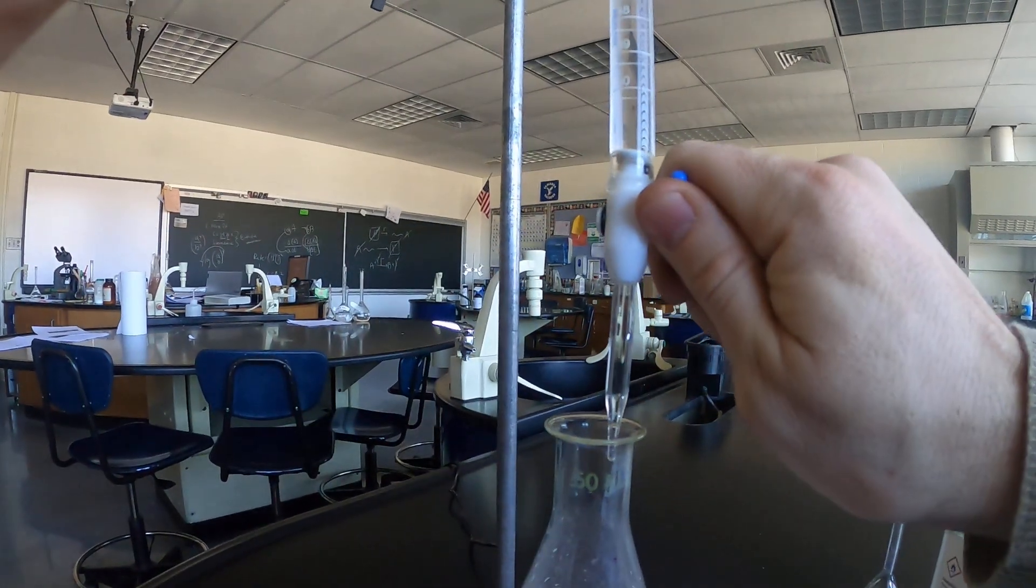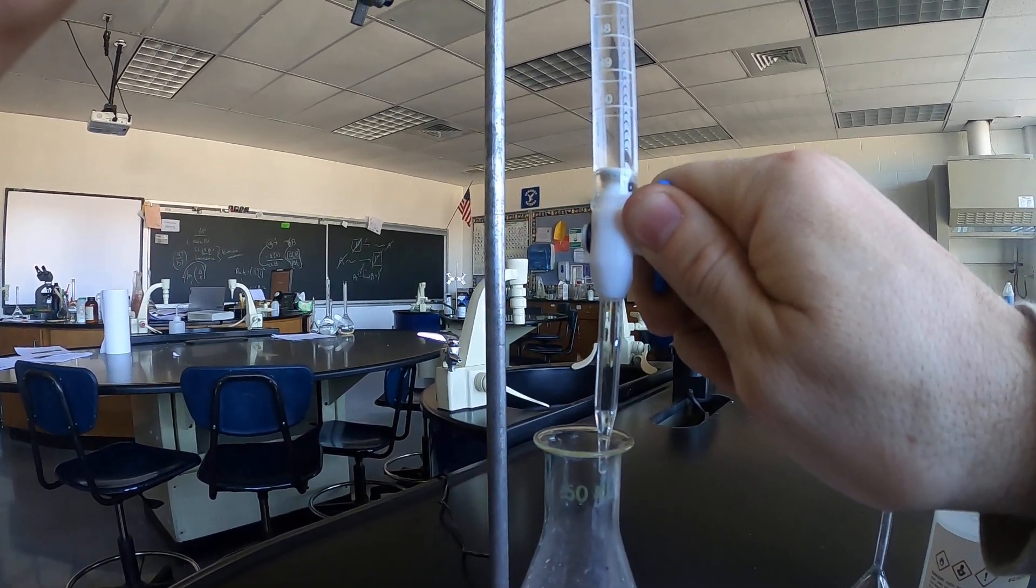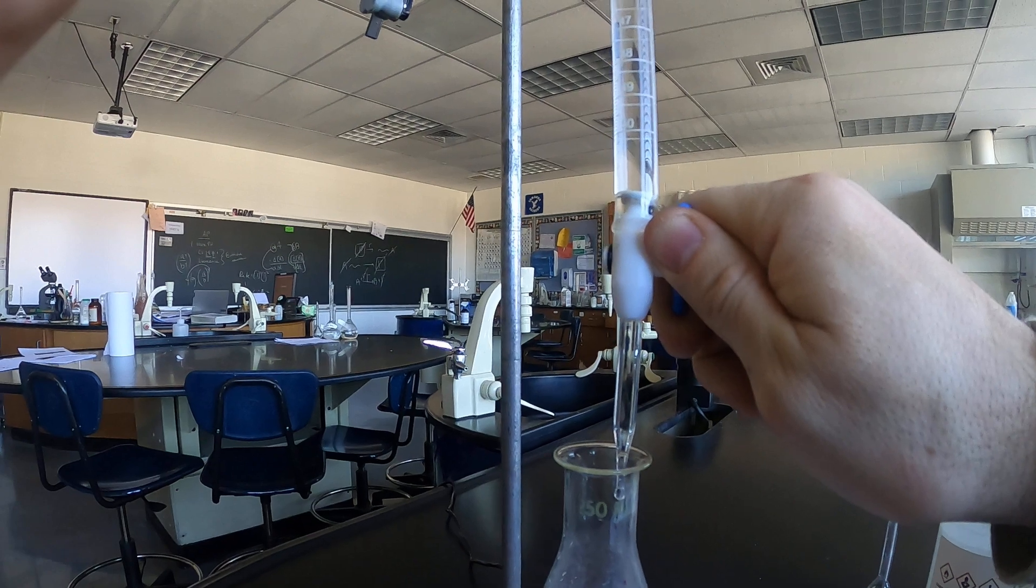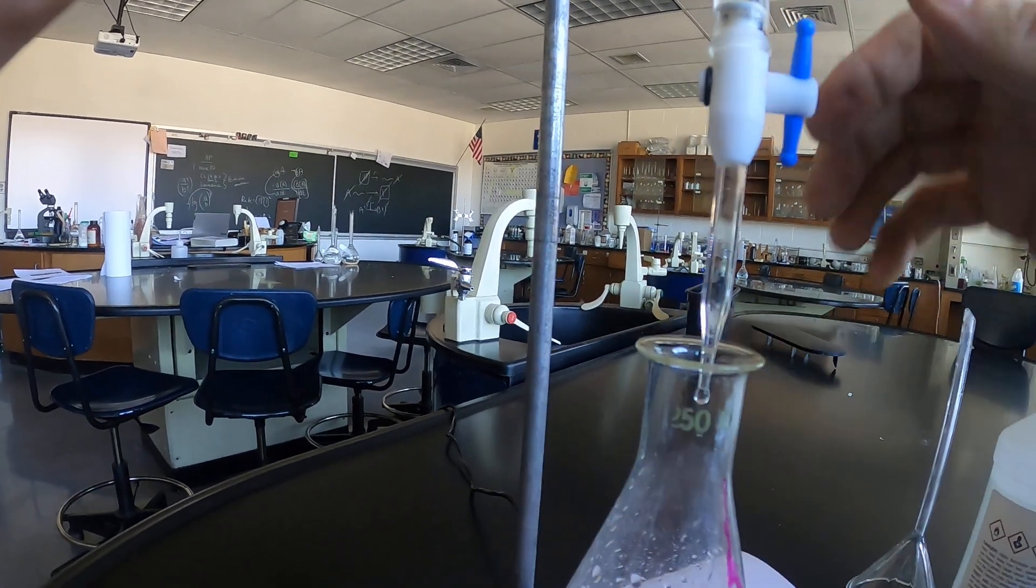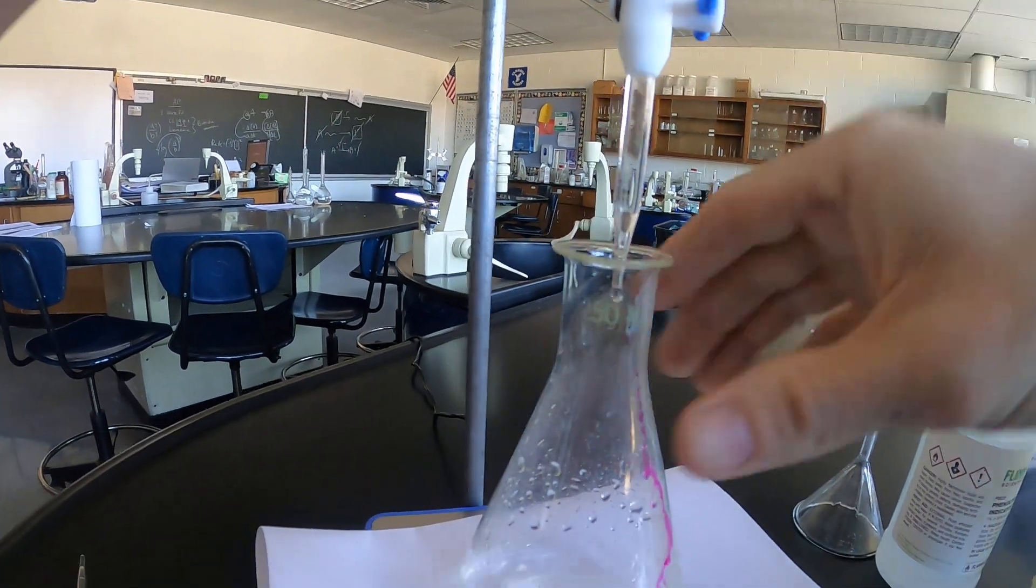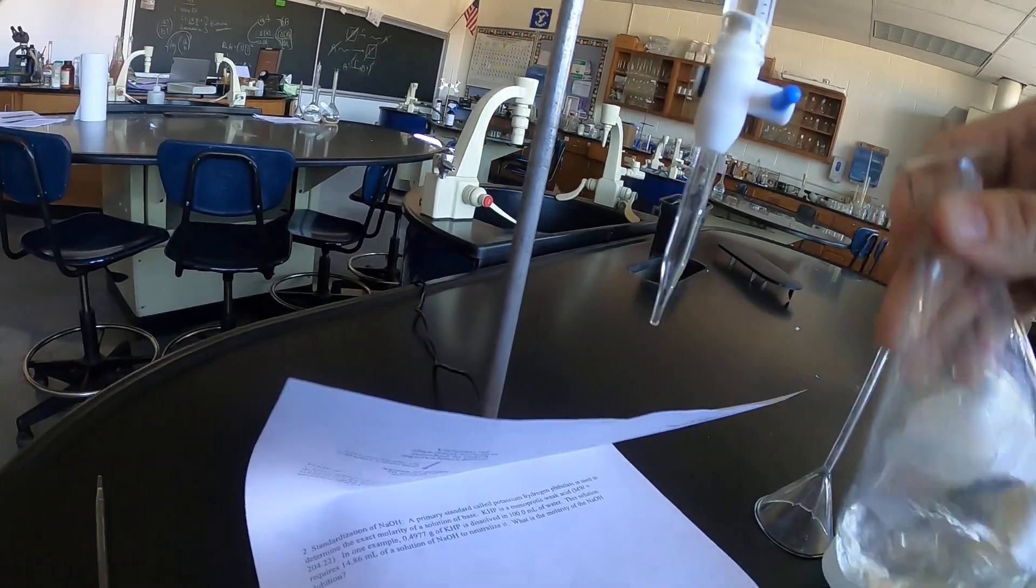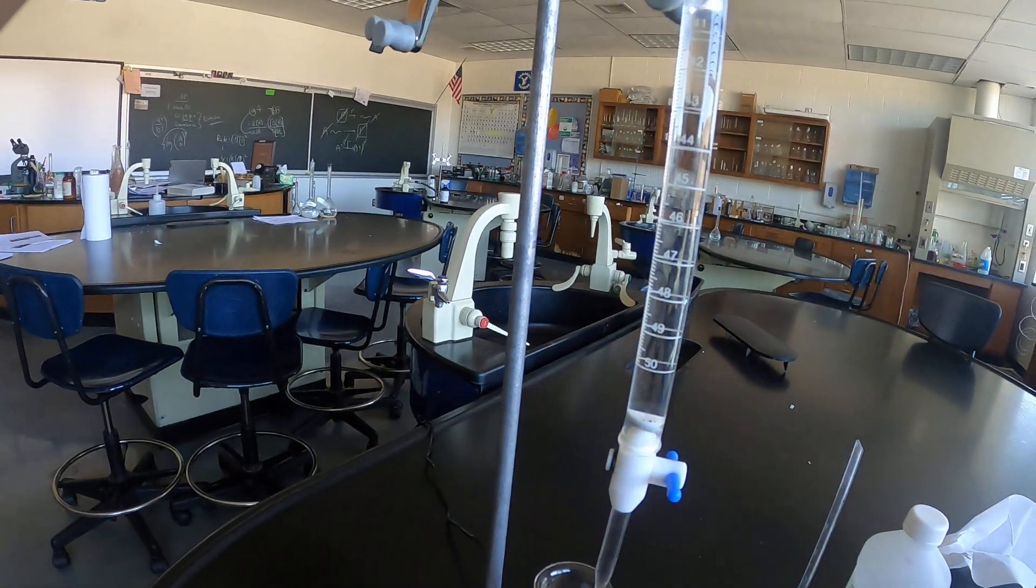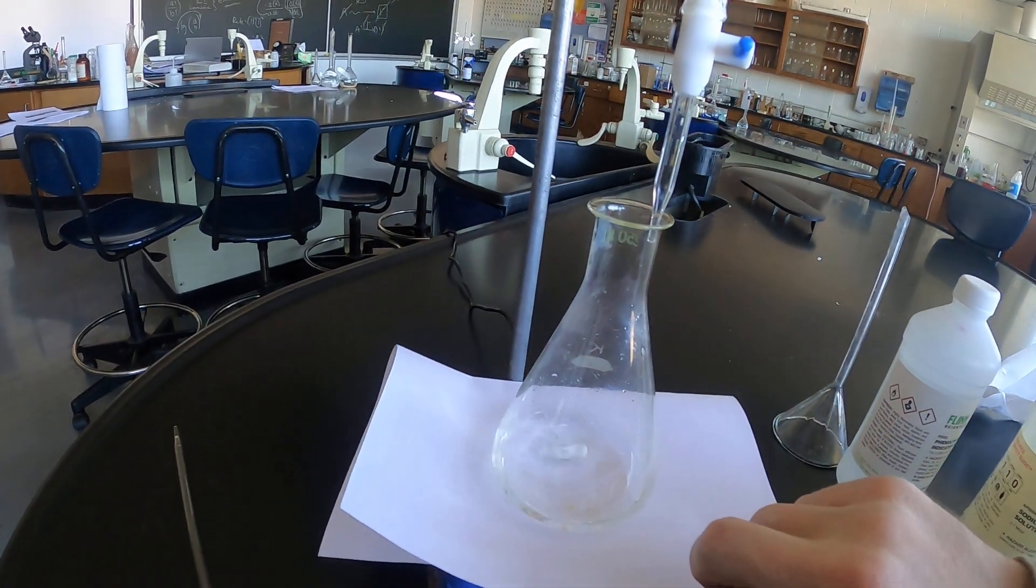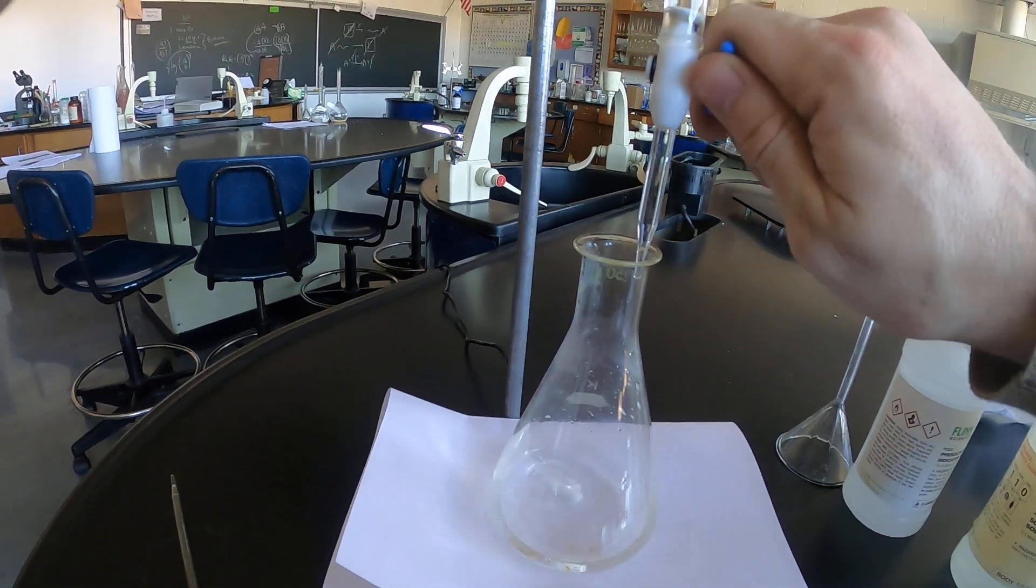At this point in the titration you want to adjust the stopcock so that you are titrating dropwise which takes a little bit of practice. Okay now this is coming out dropwise. I'm gonna swirl this to get this base and analyte off the side. I have a white piece of paper underneath so that I can see the background clearer. And I'm going back to dropwise additions.